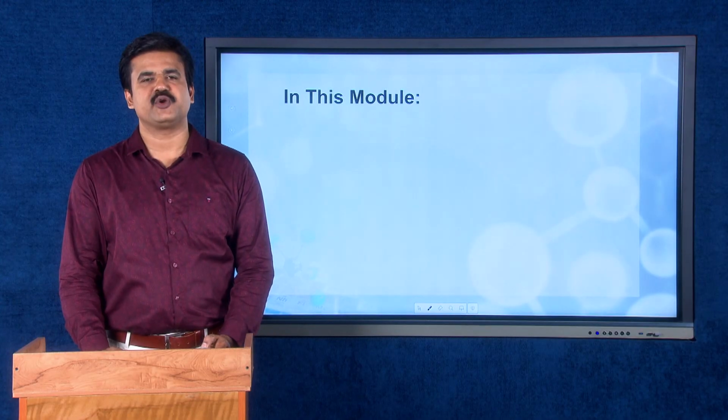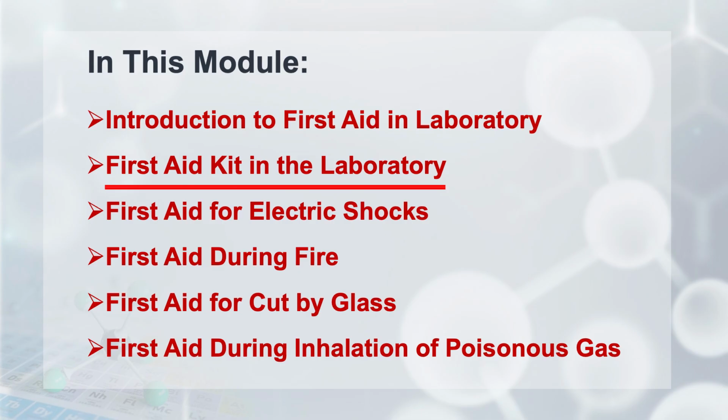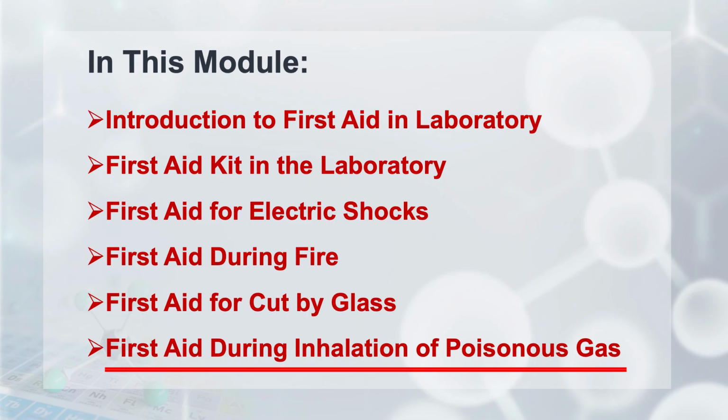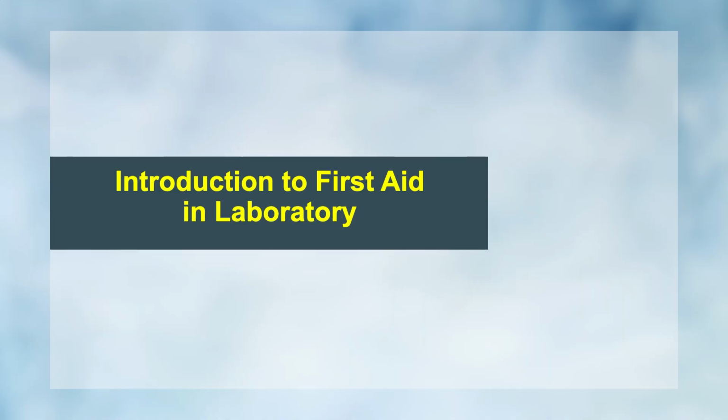The contents of this module are Introduction to First Aid in Laboratory, First Aid Kit in the Laboratory, First Aid for Electric Shocks, First Aid during Fire, First Aid for Cut by Glass, and First Aid during Inhalation of Poisonous Gas. First of all, we are discussing Introduction to First Aid in Laboratory.